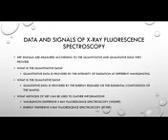X-ray fluorescence spectroscopy signals are measured according to the quantitative and qualitative data that they provide. The quantitative data is provided by the intensity of the radiation at different wavelengths. The qualitative data is provided by the wavelengths of the energy released.